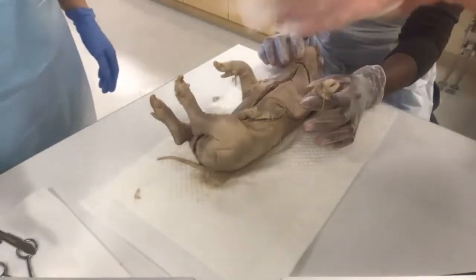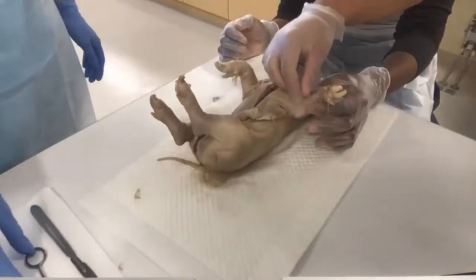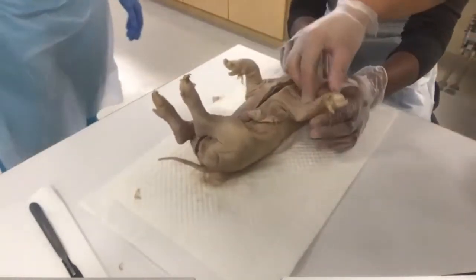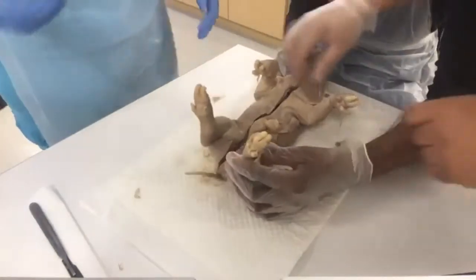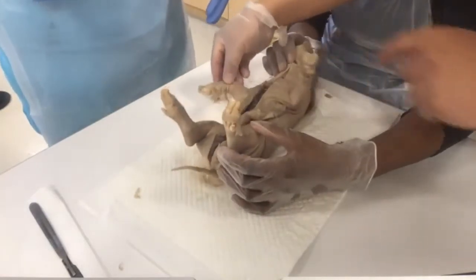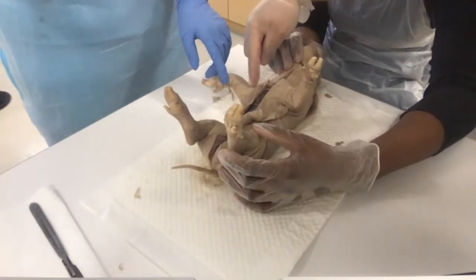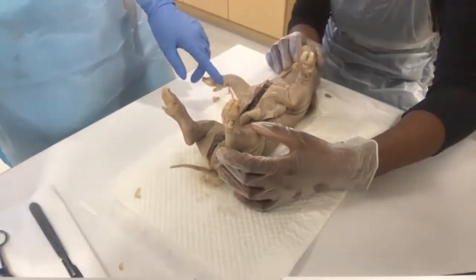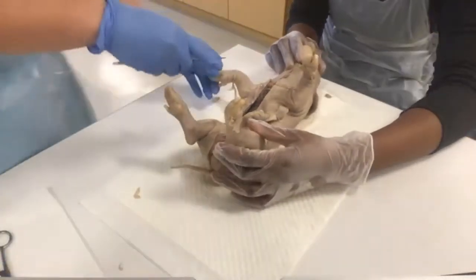So now, the next thing I want you to do, and you could use these straight scissors, is to open this up, kind of like that. Your job is to hold this so that we can properly visualize it. You can put your other hand right down like that. Now, dangerous, so use this one, the one closest to you. So open this up, just like the way we opened this up, make an incision here, like a big H. Then we're going to open it up so we can start looking at muscles and tendons.